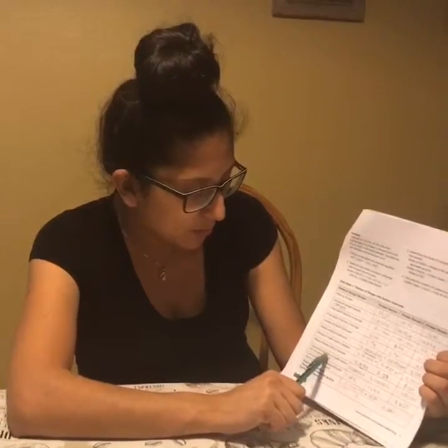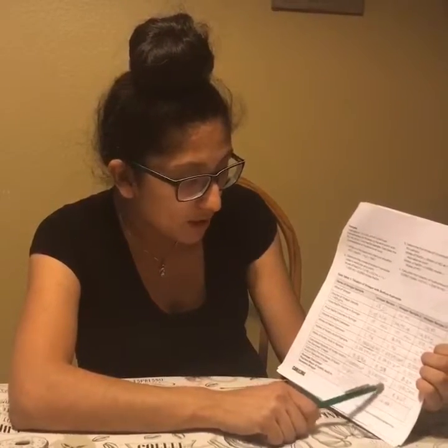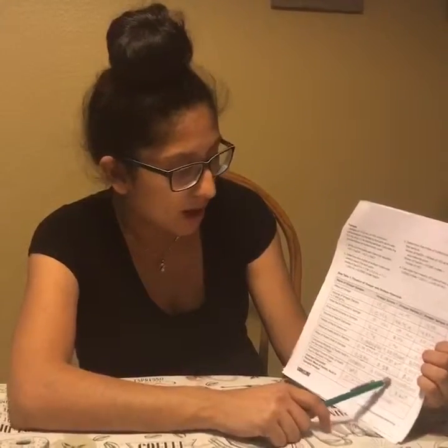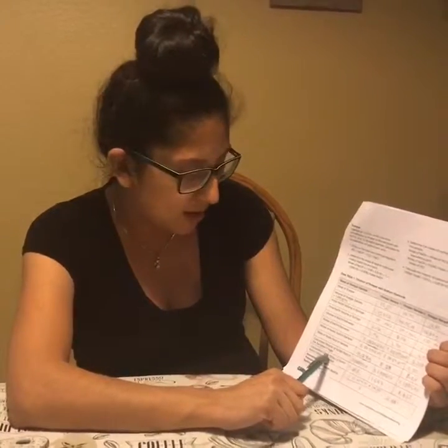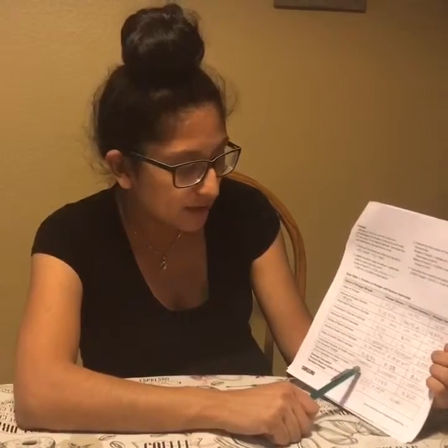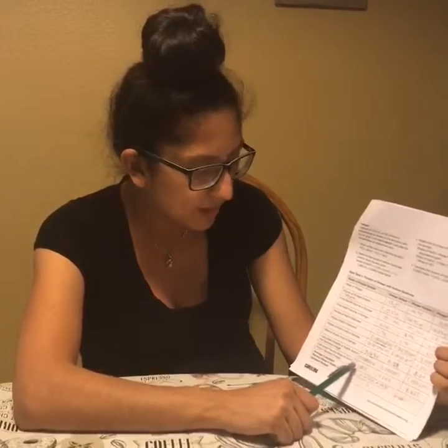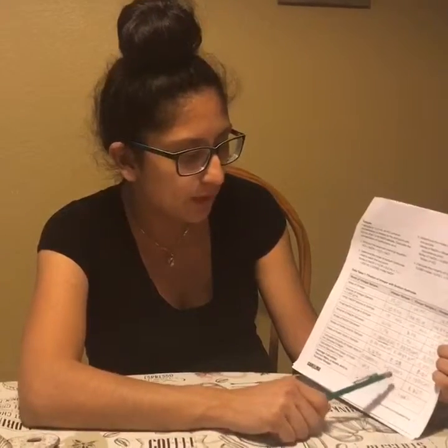The calculated molarity of the acetic acid, again, was pretty much within the same range, just a couple of numbers different. The calculated percent of mass of acetic acid in the sample vinegar, again, was all within the 1% range. One was 1.60, the second sample was 1.54, and the third sample was 1.62. So all of them were pretty much within the same range.